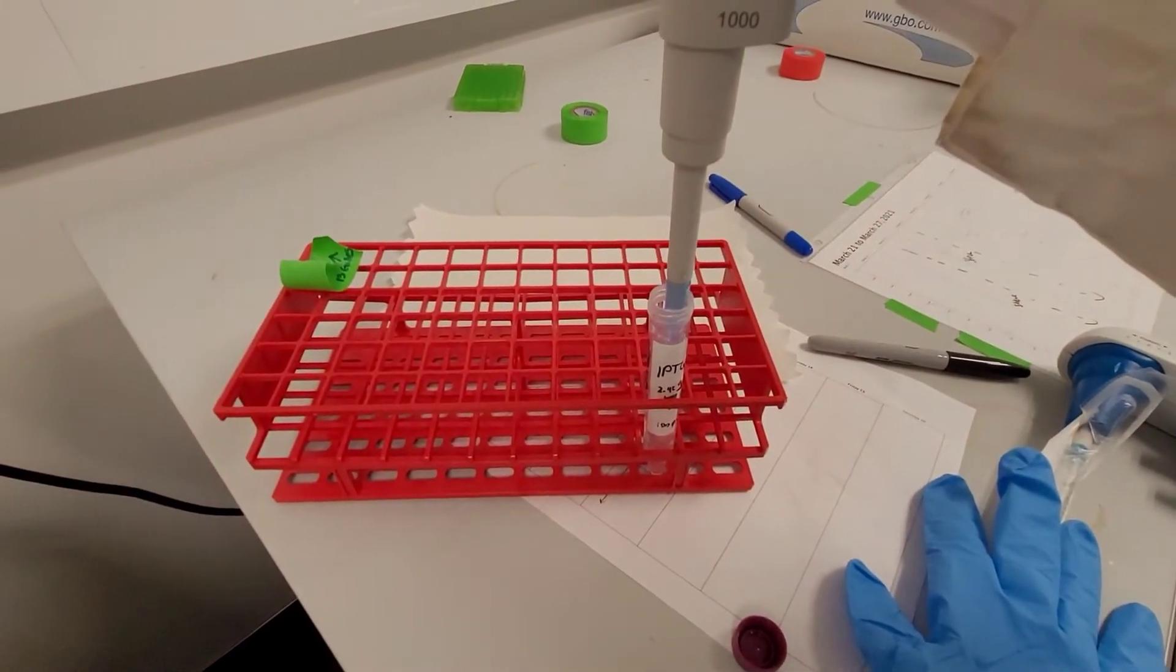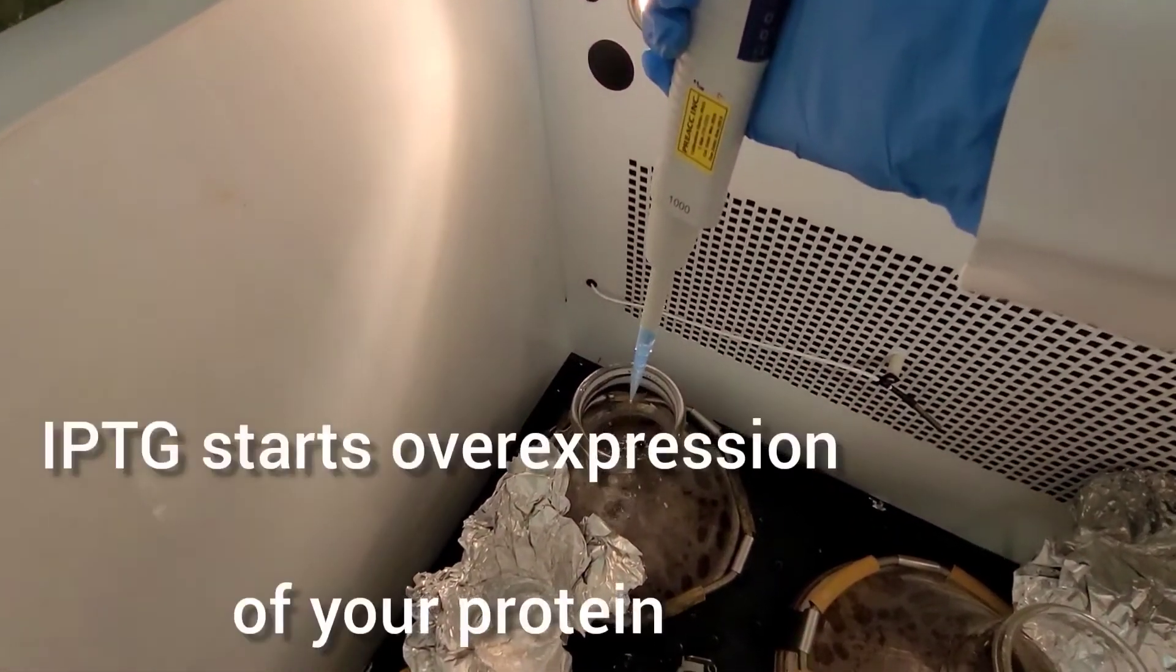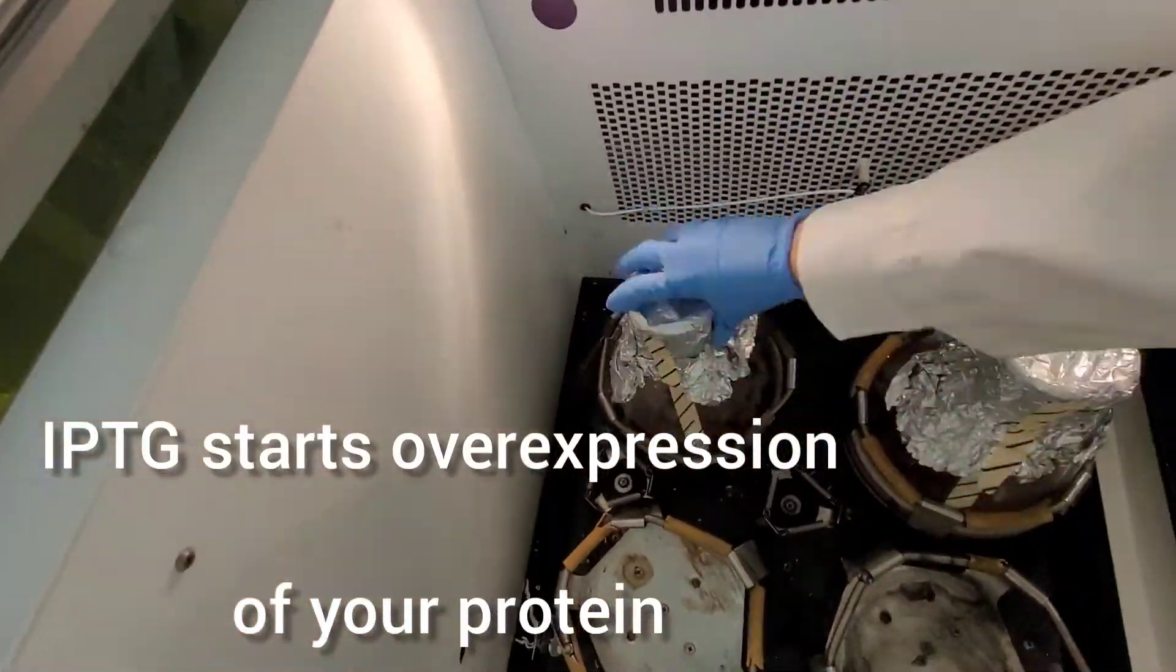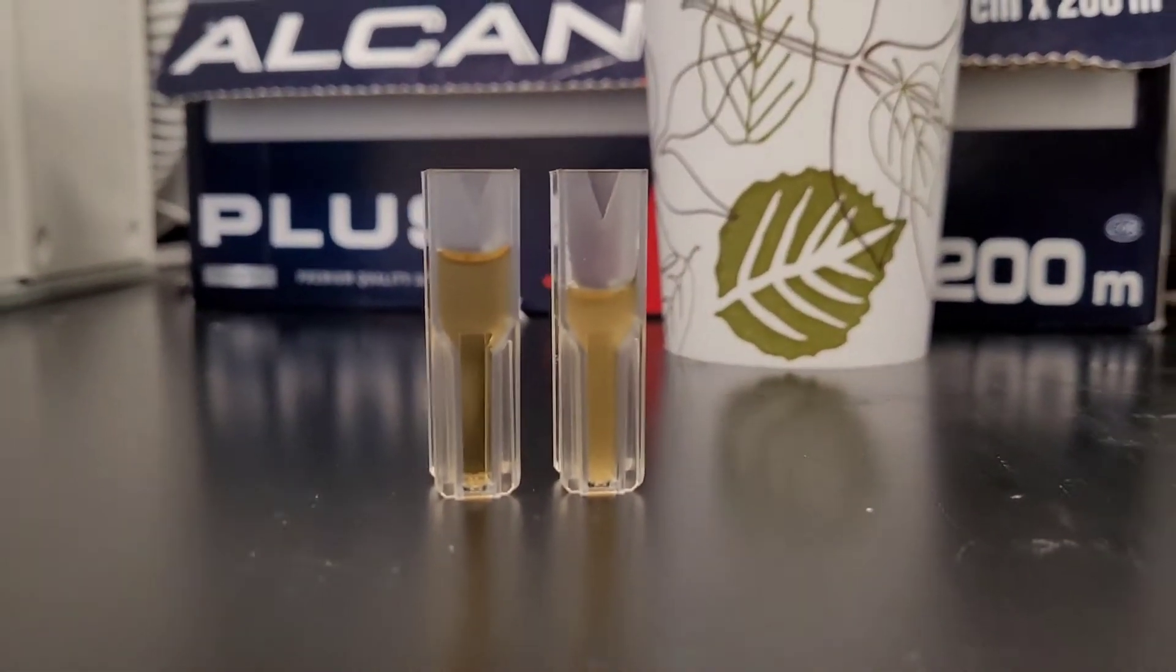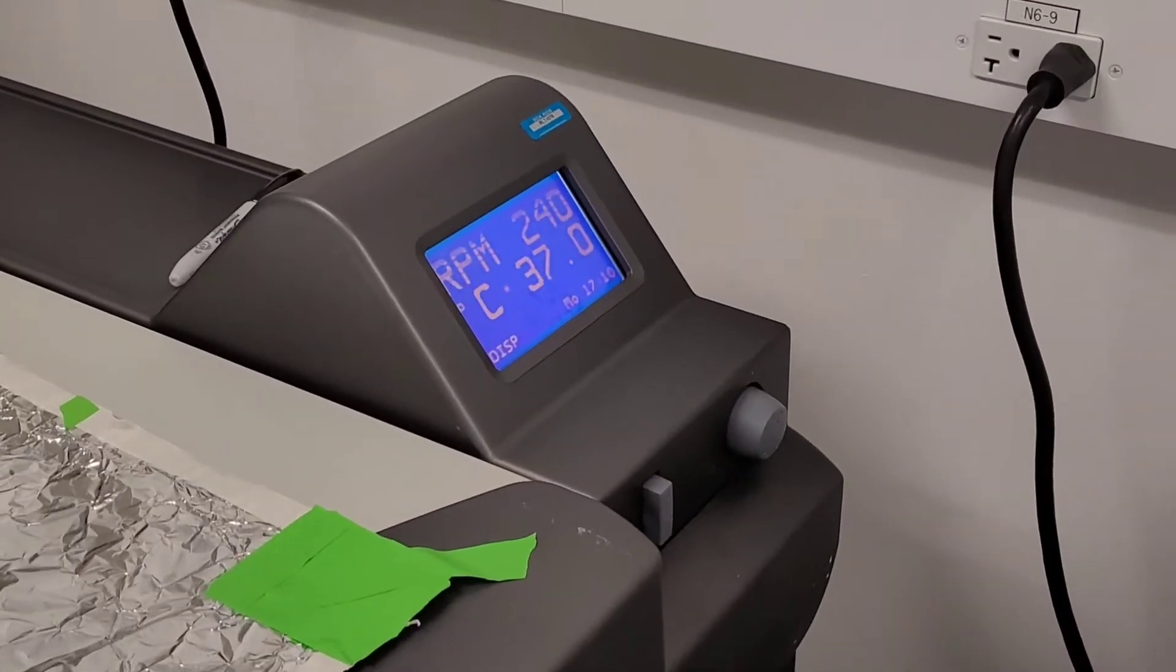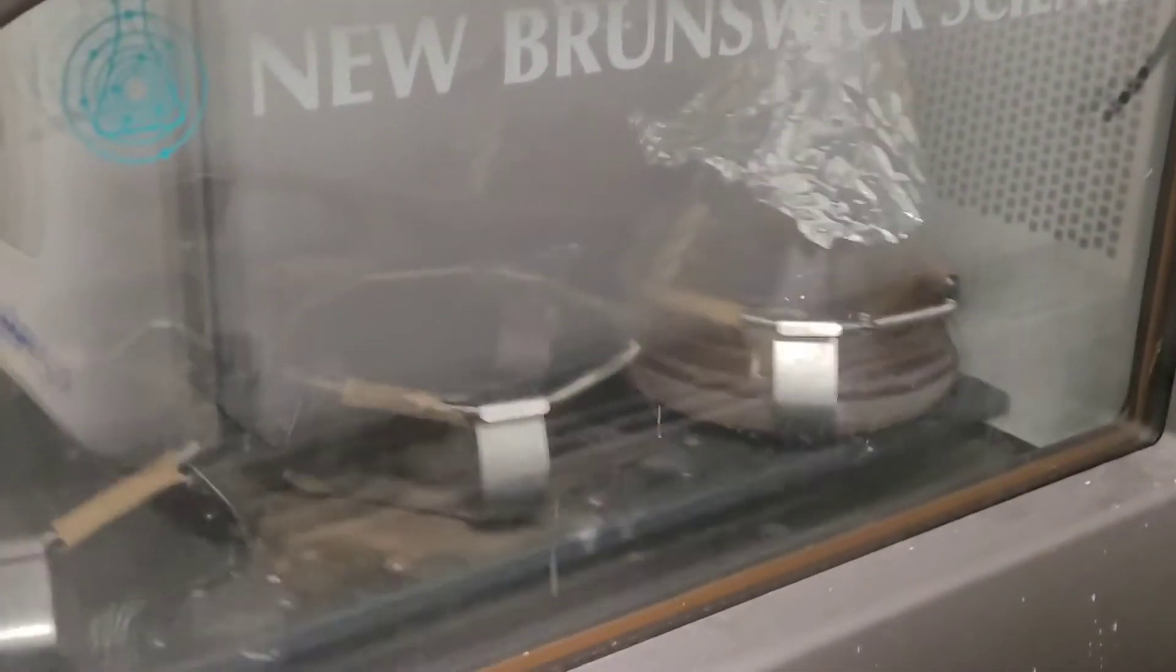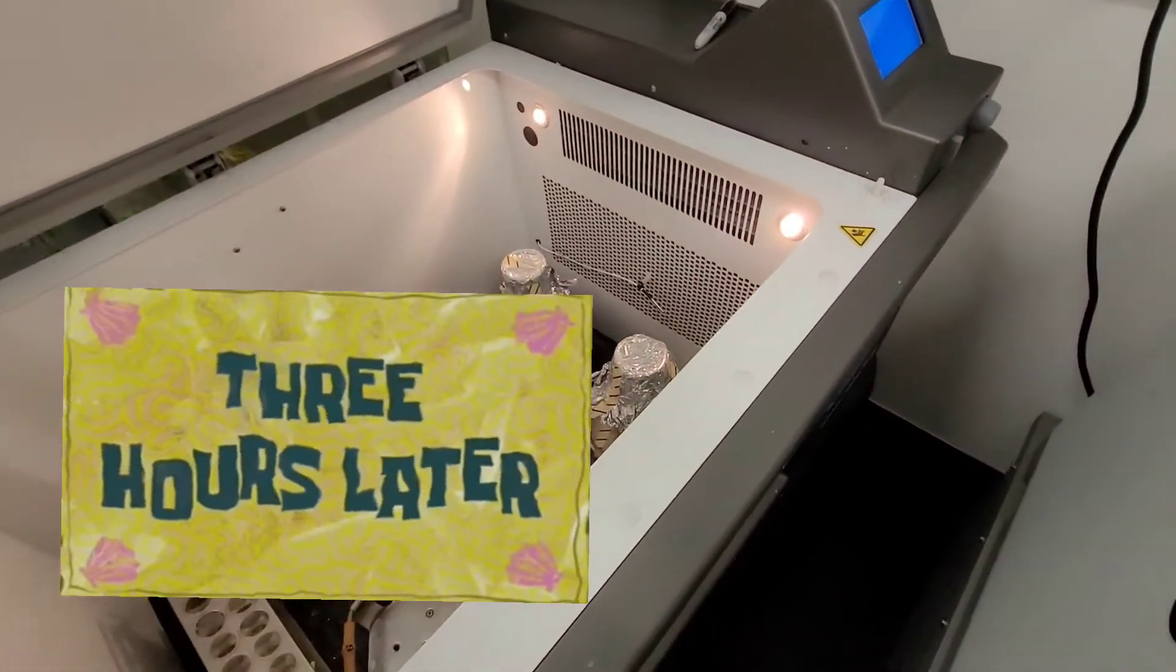After you reach the optical density of 0.7 to 0.8, you can add one mil of IPTG, or isopropyl thio galactopyranoside. This will promote the expression of your protein. This is like a similar molecule to galactose and it will permanently induce the expression of your protein. After you do this, the growth of the cells will stop and then all the energy will go towards expressing the protein. After this you need to leave it for three hours at 37 degrees.